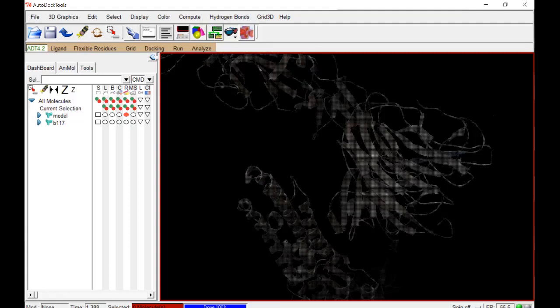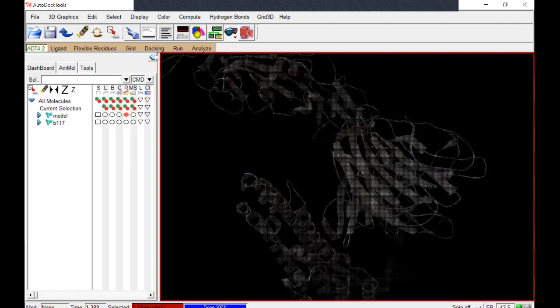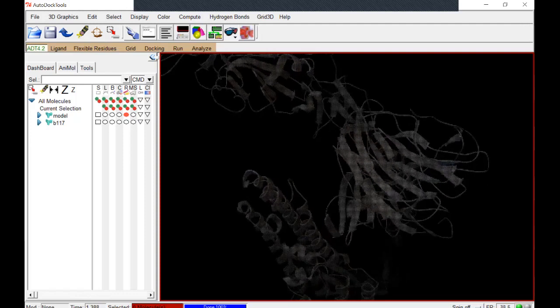All of my protein folding will be based off of that template. So I'm using the same template to fold all the proteins for the spike protein, and I am using this structure that's on the screen right now as the comparative to be able to compare.